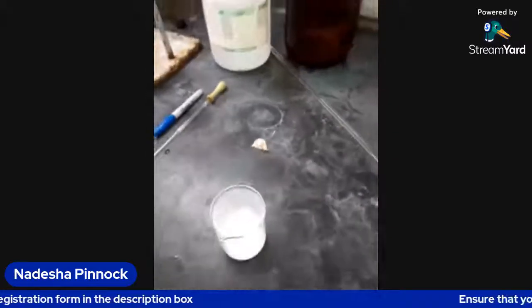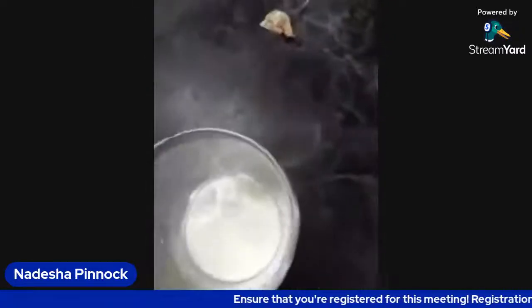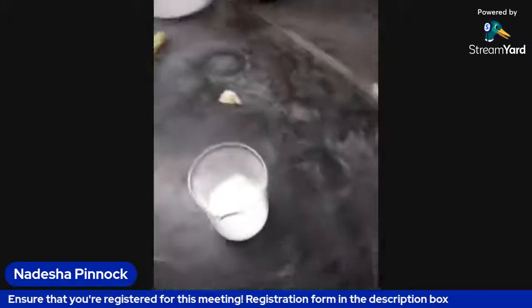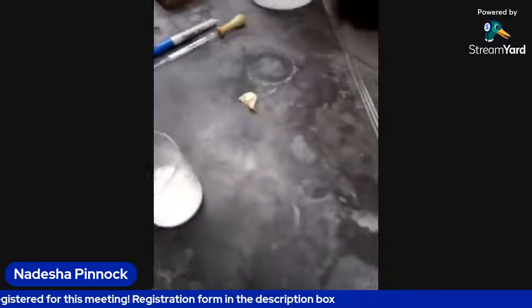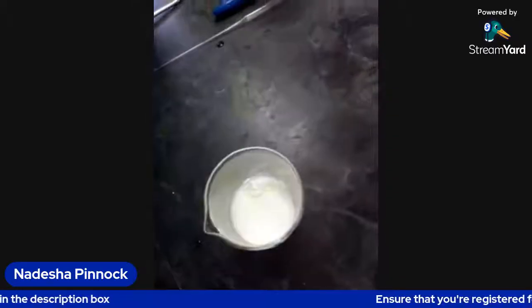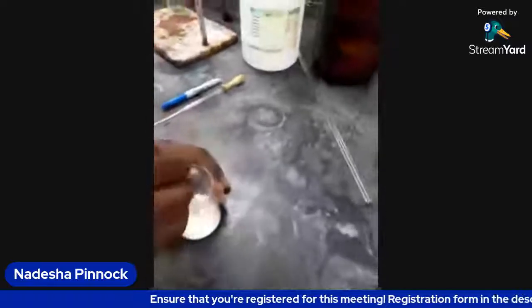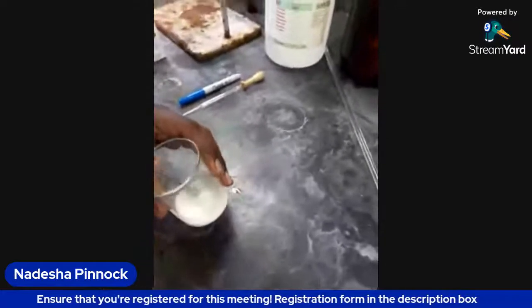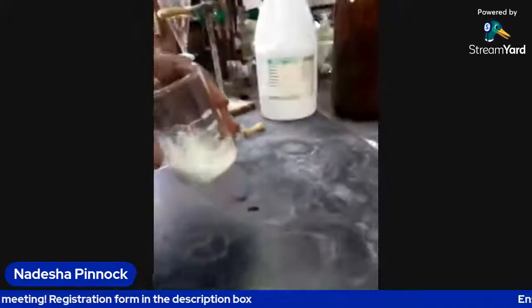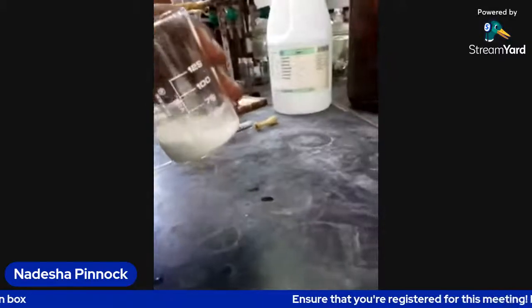So we're measuring out 10 mils again, and we're going to add it to the cornstarch and then mix until we get an even suspension. We're adding another 10 mils, and then we are going to mix until we get an even suspension. So it should appear nice and milky white, like what we have here. We just mix until it's even.